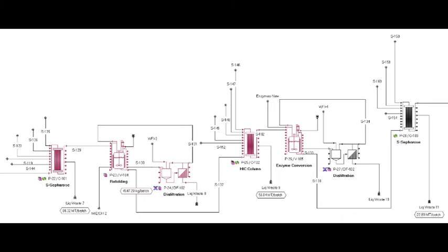Operation Unit 24, Diafiltration DF102. The refolding reactants are replaced with WFI and the protein solution is concentrated using a diafiltration unit that has a 95% product recovery yield. 5% of the protein is denatured. The volume is around 4,500 liters.